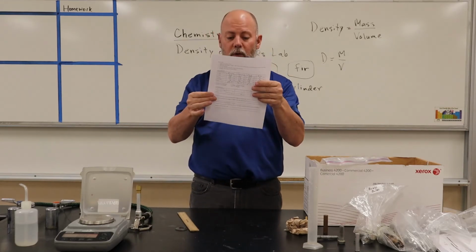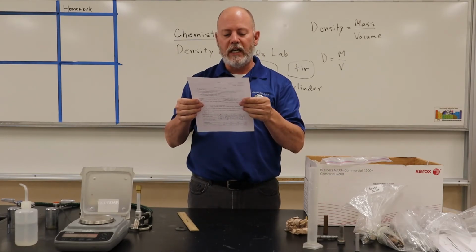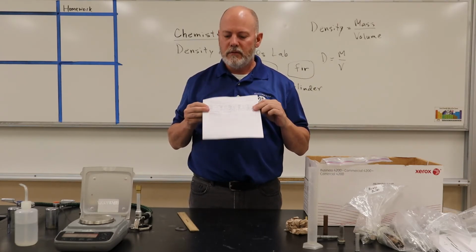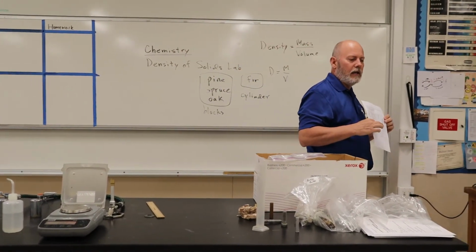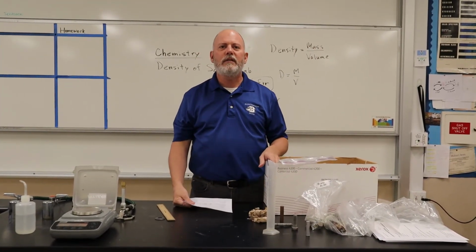So we will, in class, do the calculations, and we'll see how close we get to the accepted values, which are on a chart. We'll see how well me and Mr. Iwan did in our lab work. But any last words, sir? No, I think that's pretty much it.